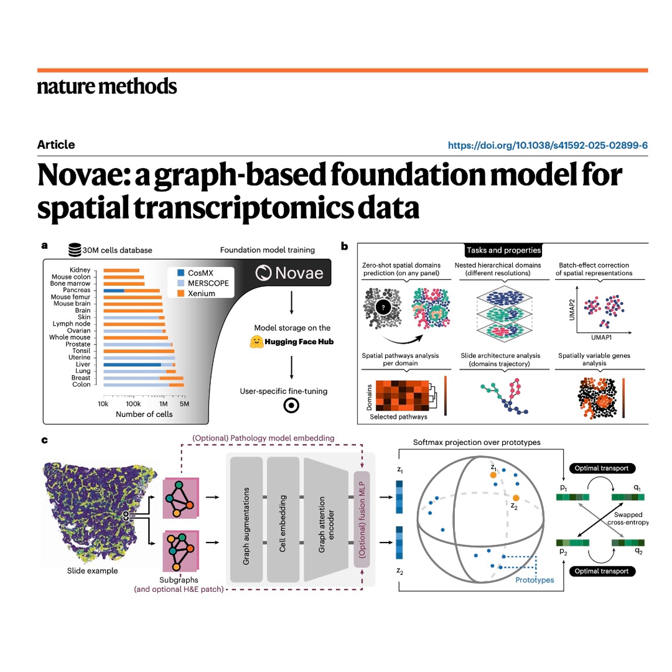While Novae is architecturally ready for anything, you did mention one current limitation regarding its pre-trained models. That's right. Currently, the pre-trained Novae models rely exclusively on transcriptomics. Now, this isn't a limitation of the software itself, but of the data landscape. We just lack these large-scale, combined, multimodal data sets that include transcriptomics, proteomics, and histopathology, all on the same slides across a massive range of tissues. But once that data becomes available, the model is designed to absorb it.